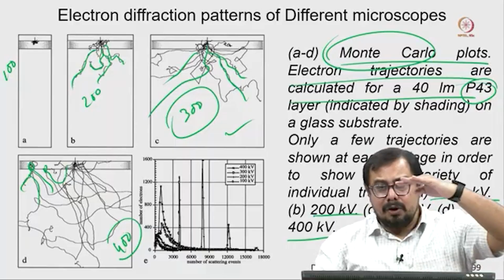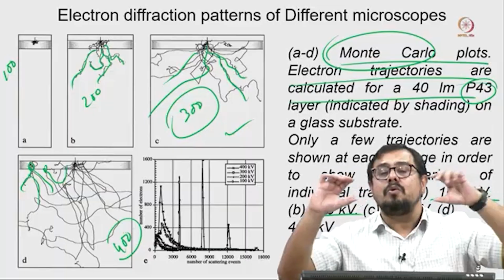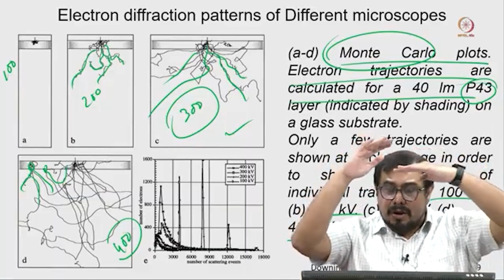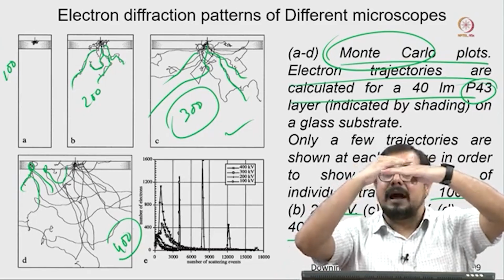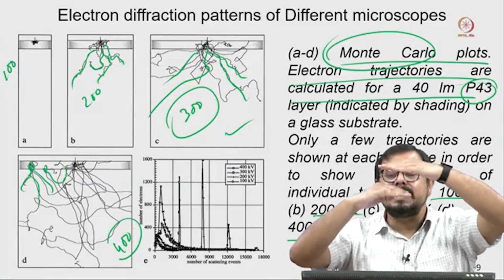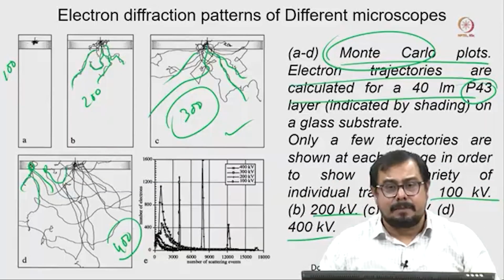So, even if we are using a 4 second exposure, we do not want to collect one integrated image of 4 seconds. We want to divide it by 10, and every 0.4 second collect a single frame, so that at a later stage I can align them properly and correct the drift.